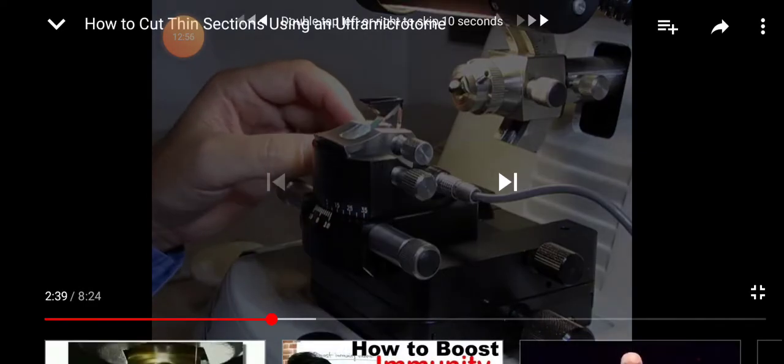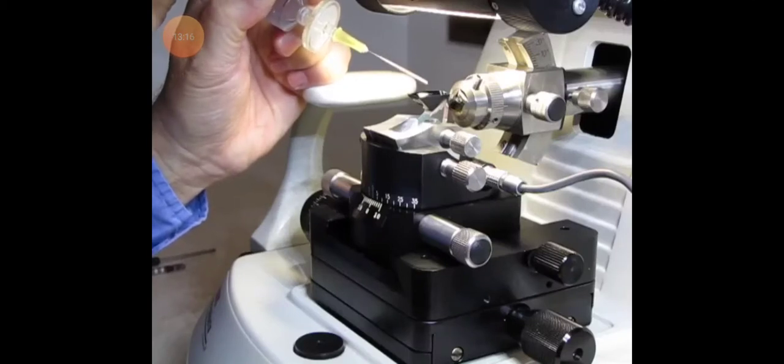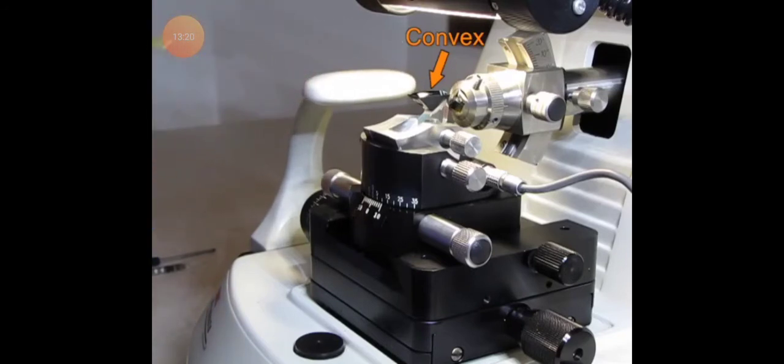It's important that the clip is secure, and we slowly add the water. You don't want to go too fast, or else the water will jump over to the back side of the knife and then get on the block face, and it takes a while to dry that off again. Slightly overfill the boat. This is water being filled into that small trough. As you see here, the knife edge is completely wet.